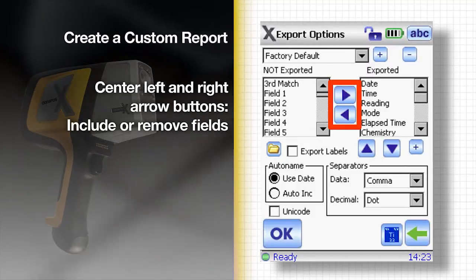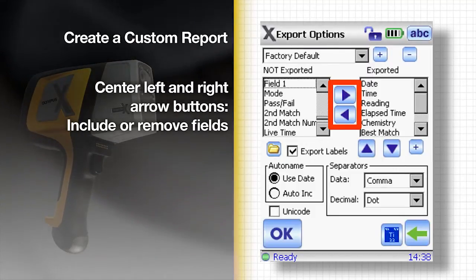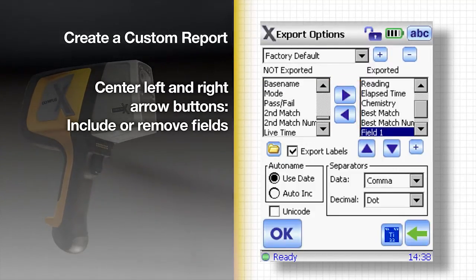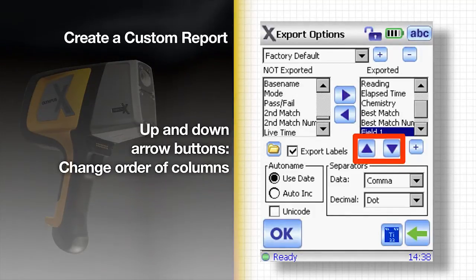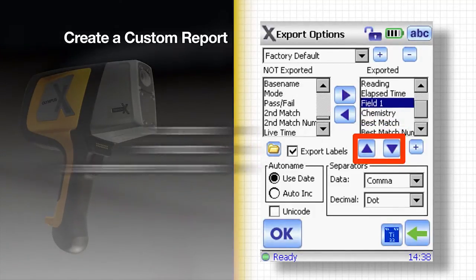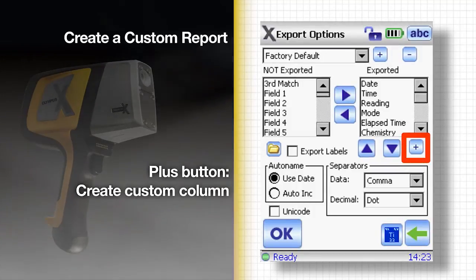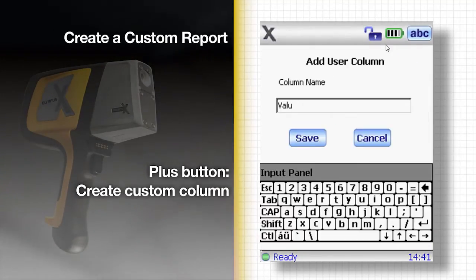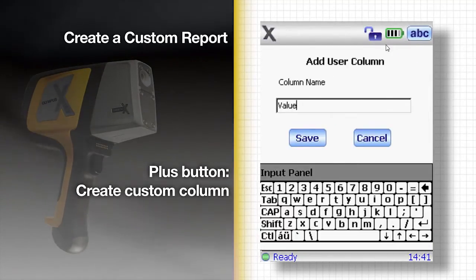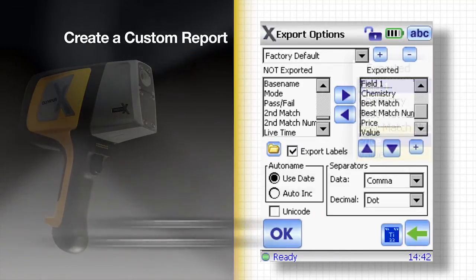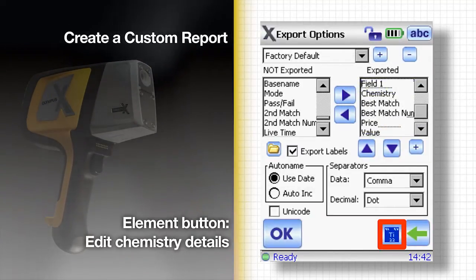Use the center left and right arrow buttons to include or remove fields from the report. Use the up and down arrow buttons to change the order of columns displayed. You can tap the plus button to make a custom column of your own, and it will be added to your list of exported columns.